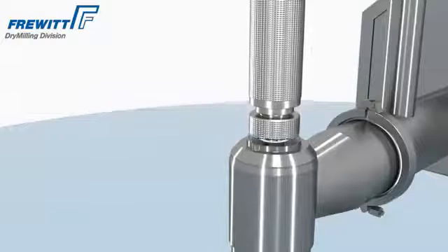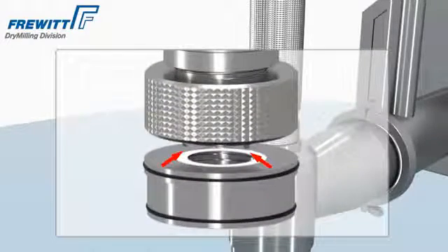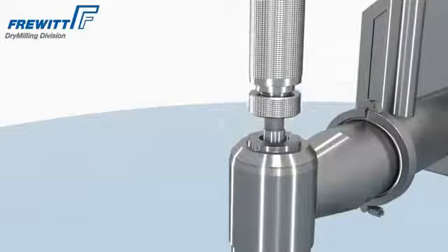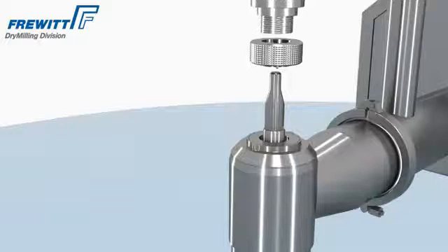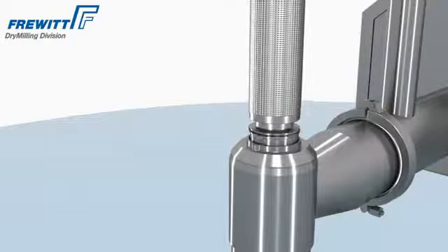The lip seal is to be replaced when changing sieves. First of all, the lip is to be removed, followed by the extraction of the old lip seal and the insertion of a new lip seal.